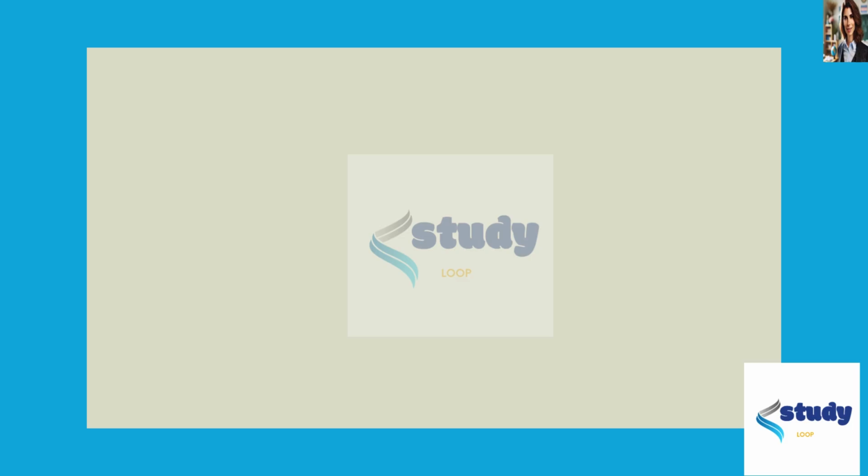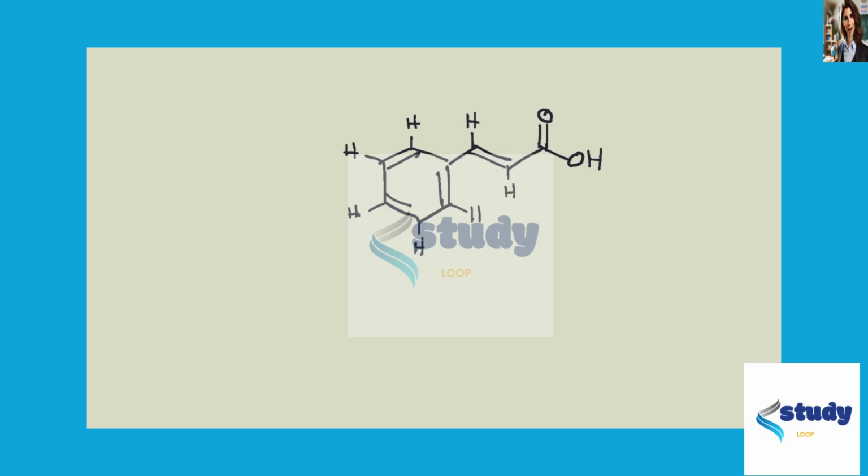Okay, we have got an NMR spectrum for cinnamic acid. What does cinnamic acid look like? And what we can do is assign each of these signals to a proton in cinnamic acid. So what may be good is to draw in protons here. And if possible, let us group them, right?